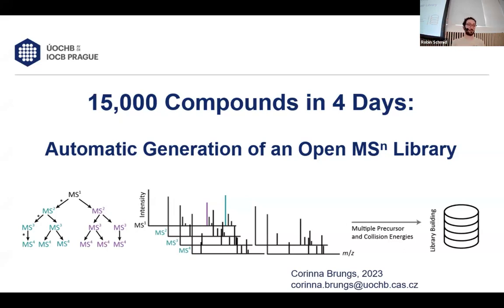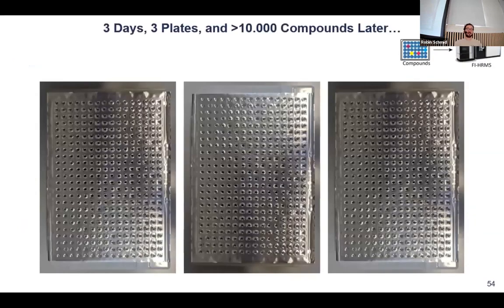start some collaboration. But it's also important, like when we buy some compound libraries, and now the struggle starts, you know? We want to measure those compounds, we want to directly extract the spectra and push them into a repository, but what is the standard way of doing that? There's MassBank, there's GNPS, so there are many different ways. And with Corinna, this is all still kind of old.